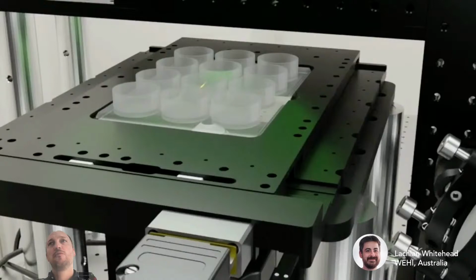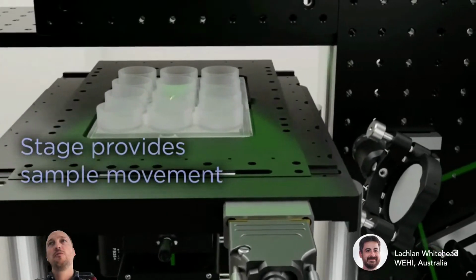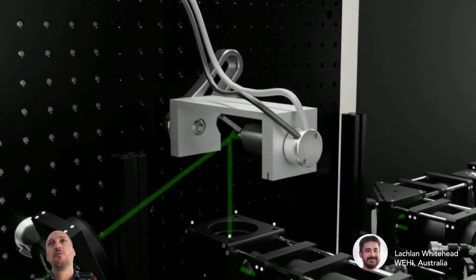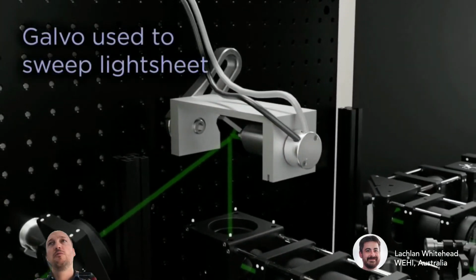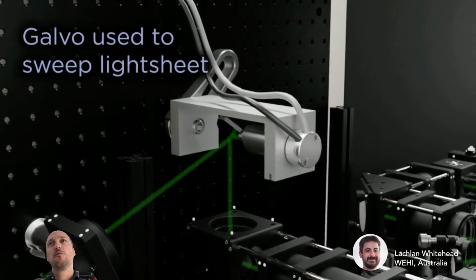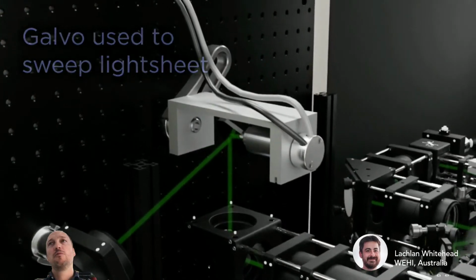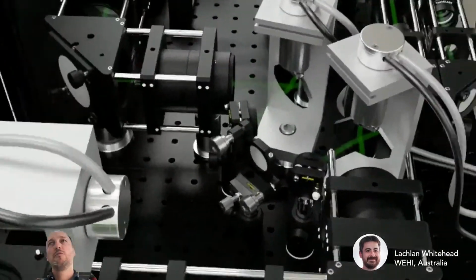Relative then with multiple samples. Here, for example, we have multiple wells. We typically right now use only one well, but you could imagine how you could scale that up and have high throughput. And this is the galvo that does the scanning and compensates the movement of the stage again.